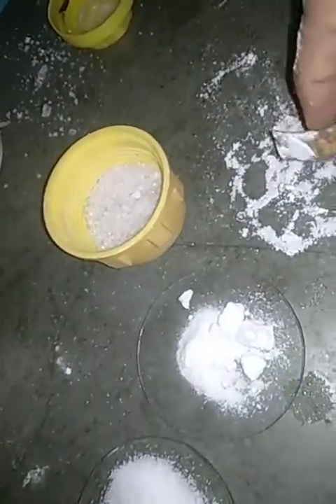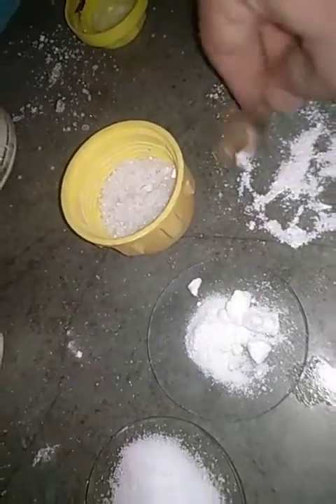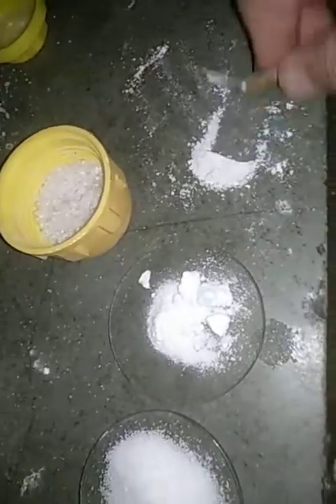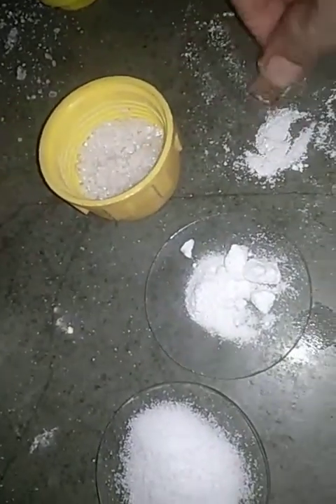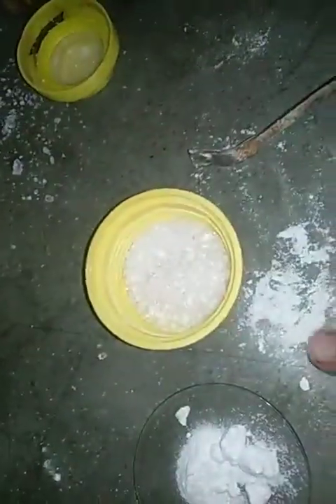You can see that the crystals of barium chloride are broken into small pieces. So we can say that ionic compounds are brittle. When pressure is applied, they turn into small pieces. So now you can understand that there is a difference between the crystals of this barium chloride and this.